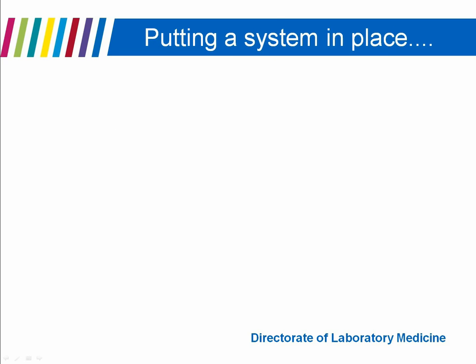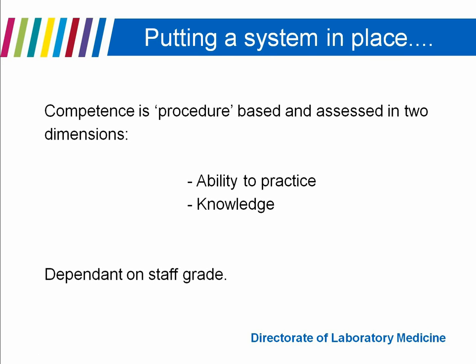So, putting the system in place, what do we actually do at Manchester Royal Infirmary? So, all our competencies are procedural based, and we assess both the ability to practice, so the individual skills of the individual, the technical skills, and we assess their knowledge.